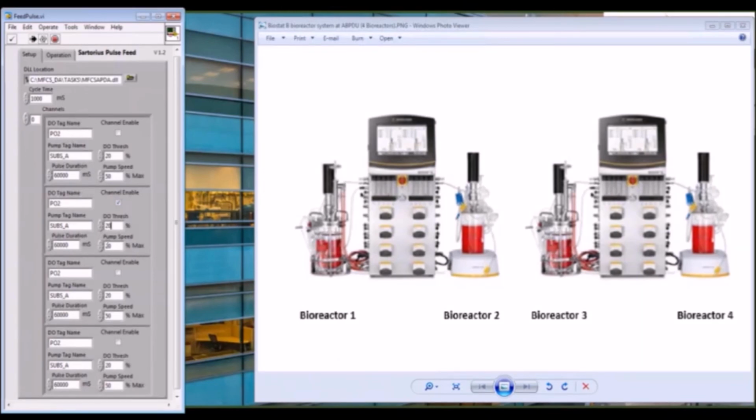and the next iteration of feeding may begin. If you are unsure how to design your feeding regime in your own experiment, try to aim for a 5 grams per liter substrate bolus delivered in a 10-minute pump interval. This will keep your cells happy for a while, and it gives you enough time to evaluate the situation and to make changes to the LabVIEW parameters as needed.